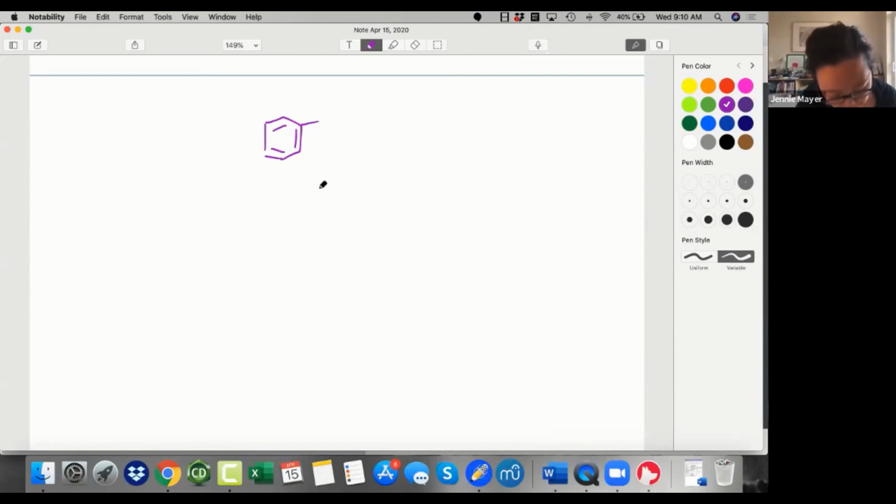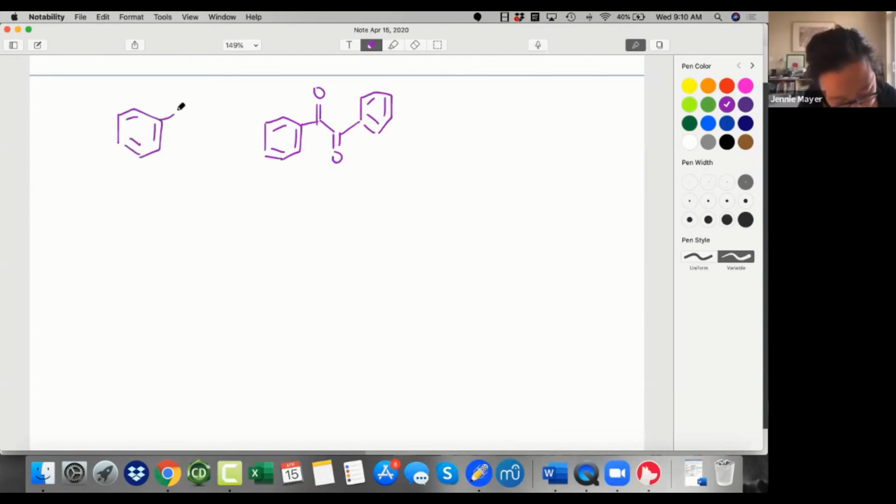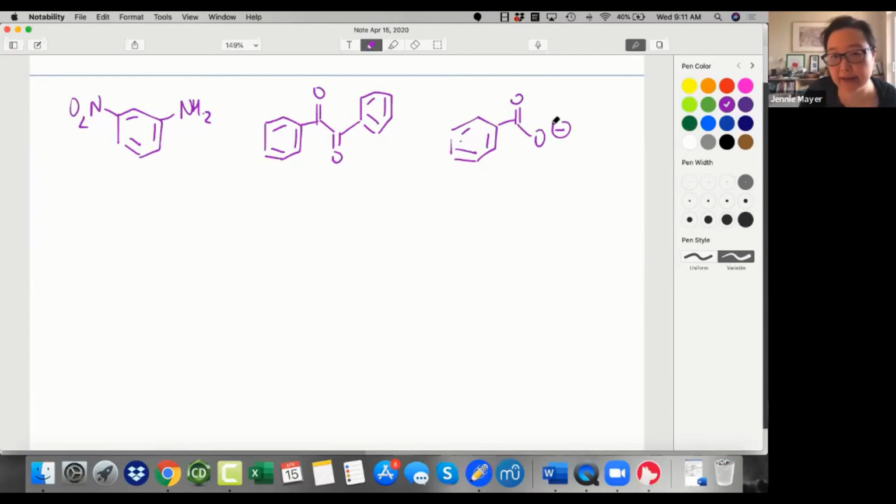Does anyone know why it would not be so great? Doesn't the acetone bond with itself in water or something like that? Yeah, acetone bonds with water, and it just would not give you two layers. You need a more extreme pairing. You need something that's really polar like water and something that's really nonpolar like methylene chloride or ether, which is usually used.